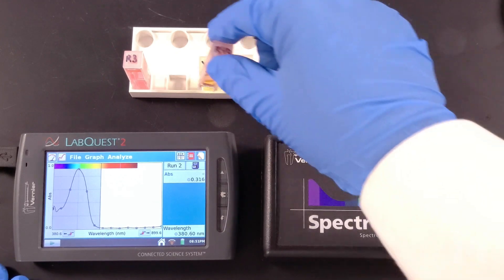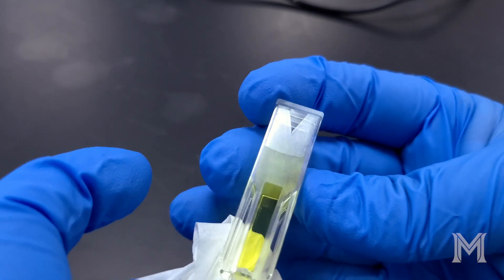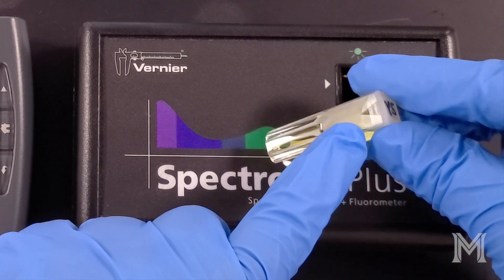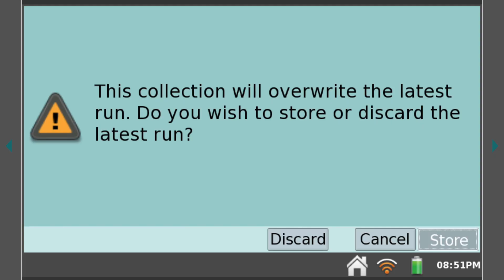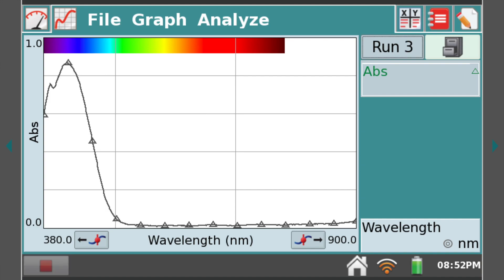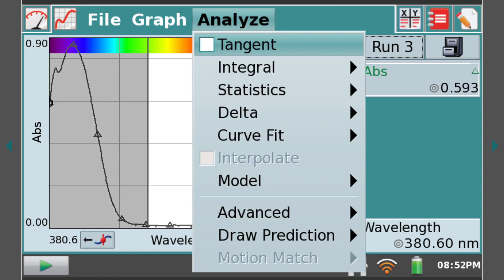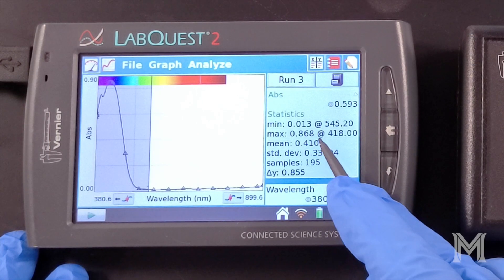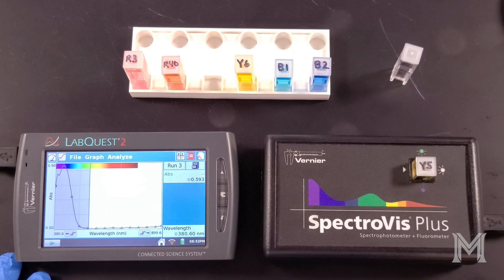Remove your sample from the spectrophotometer and select another sample to analyze. Be sure to use gloves when handling your cuvettes — dust or fingerprints can be removed using a chem wipe or soft cloth. Insert your next sample into the spectrophotometer, making sure the arrow on the cuvette aligns with the arrow on the spectrophotometer. Collect your new spectrum, store the old one, and hit the Stop button to complete data collection. This dye absorbs in the blue-violet region of the spectrum, with a maximum absorbance of 0.868 at a wavelength of 418.0 nanometers. Clear your statistics and prepare to analyze another sample.